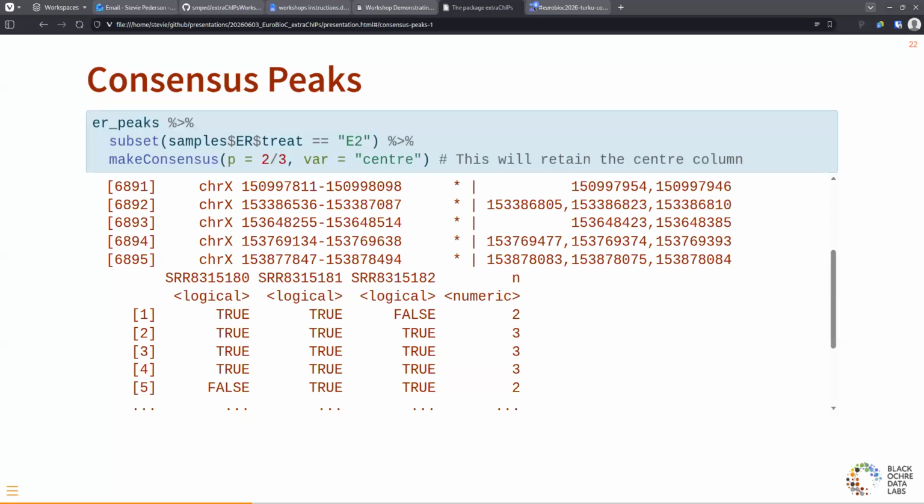So you only work with 1 object in the end. Yeah. It's a good question, and maybe I could have extended an object class here to incorporate that, but I stuck with the existing object classes. Yes, I could have put it in metadata. That's a good question, and perhaps I should give that more careful thought.